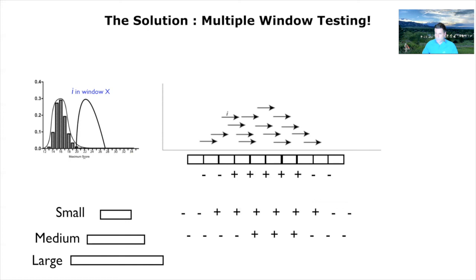But now a medium window would then say, oh, the signal's more in the center, and a large window is only going to get only one little spot where it's significant. And this is important because if you have a sharp peak, you want to use small windows so that you get that quick up and down of the peak. And if it's a long one, you want a large one. Max is going to run 2 of them and do all the right statistics that are fantastic. But you could develop a scan statistic to add to this where you test many different window sizes and say which window gave me the most significant coverage. And then that would fit the shape of your peak a little better. Bit esoteric, a little too much for now.